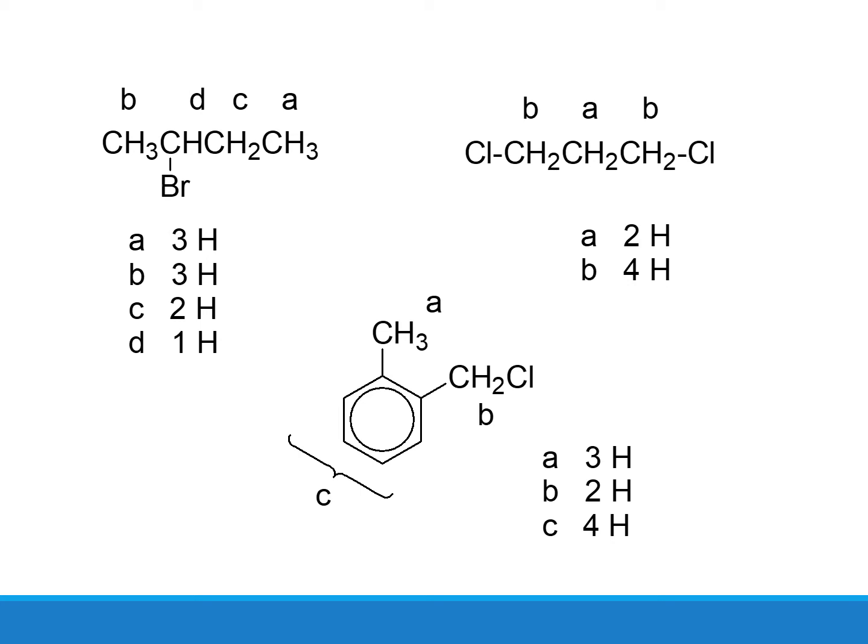Same thing here, but because this is an introductory course, try to look for different kinds of integration in different organic compounds, because sometimes they can be very tricky.